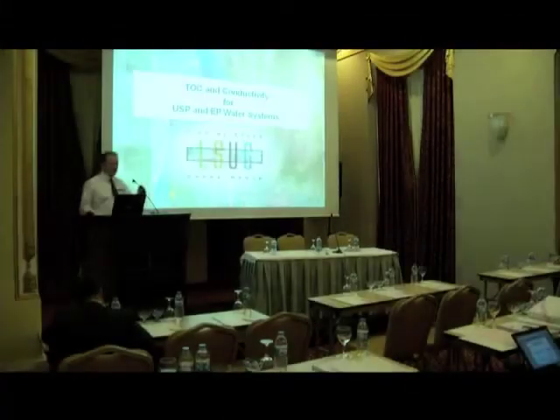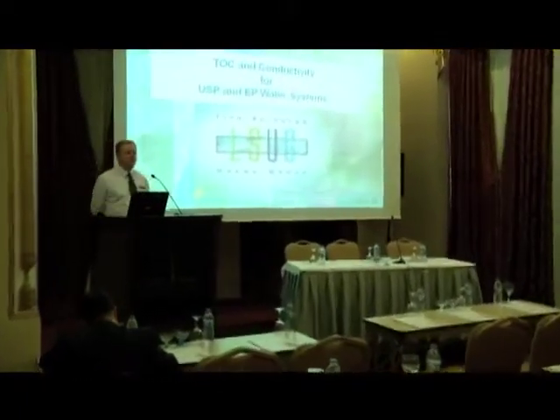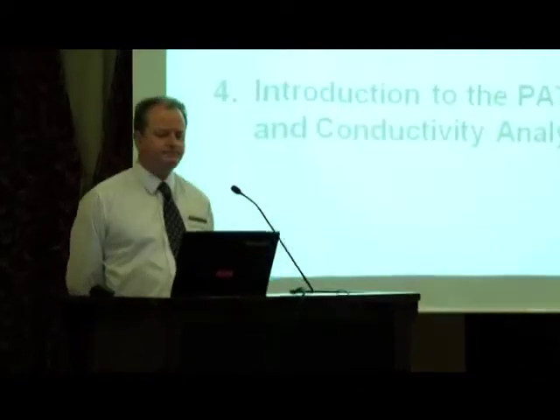Good morning, everybody. Today I'm going to talk about total organic carbon and conductivity in pharmaceutical grade water systems.